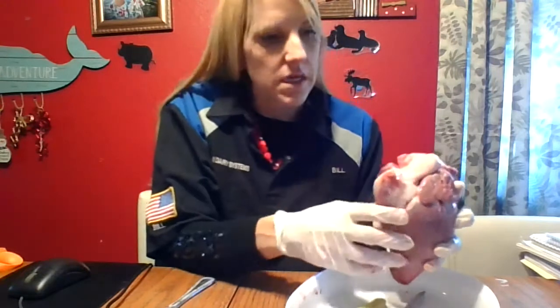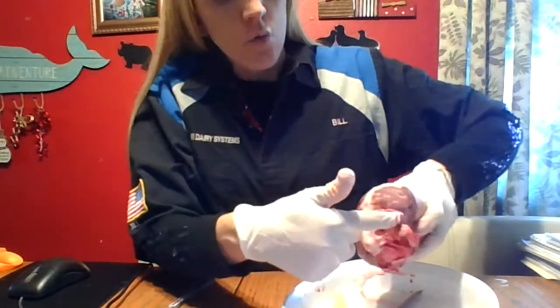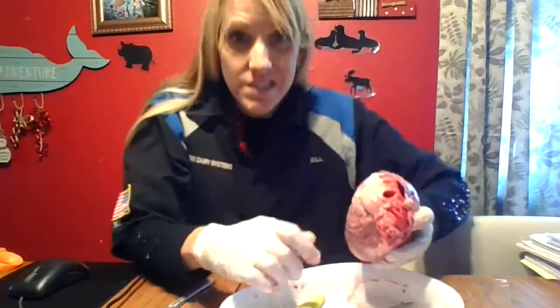So when we cut it open, you'll really get to see. Look at all these — you can shove your fingers in these openings. Can you see that? Look at how close they are together — can you see all those? They look like poses.